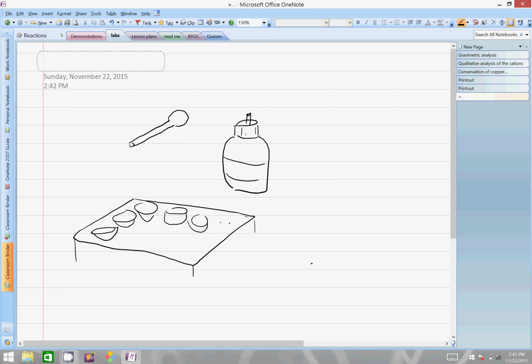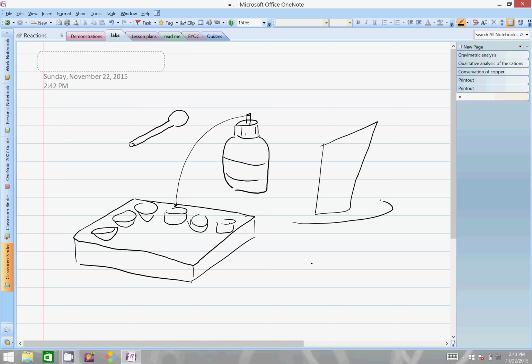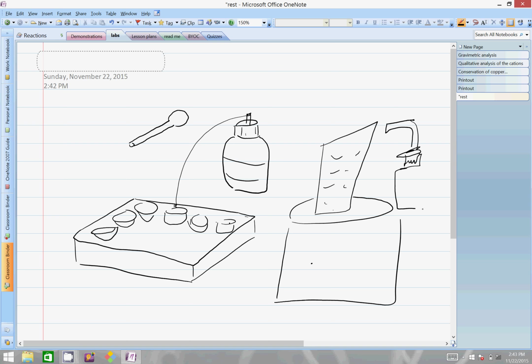We will simply be using the dropper bottle to drop in chemicals and watch them react. To clean it, you tip it outside into our waste container, and we usually use a little handheld squirt bottle to squirt water and rinse everything in.